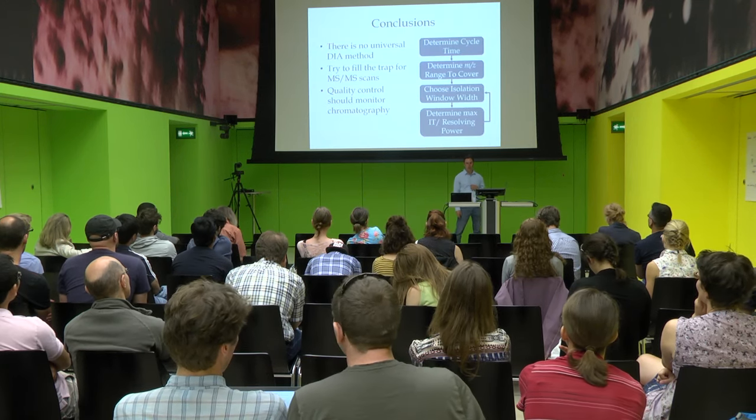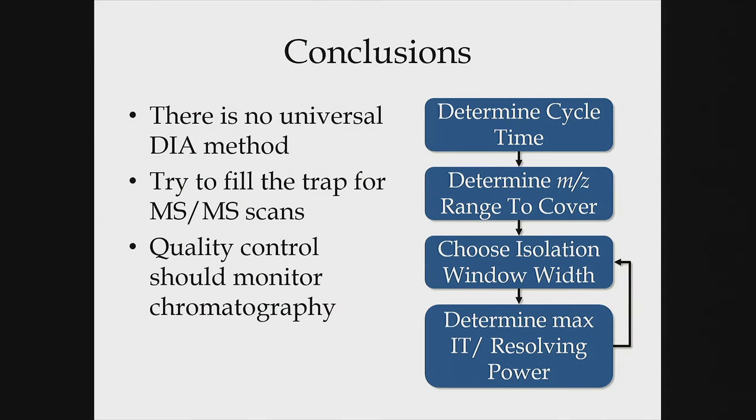So the conclusions are that there's not really a universal DIA method, but I've tried to propose a good starting point.